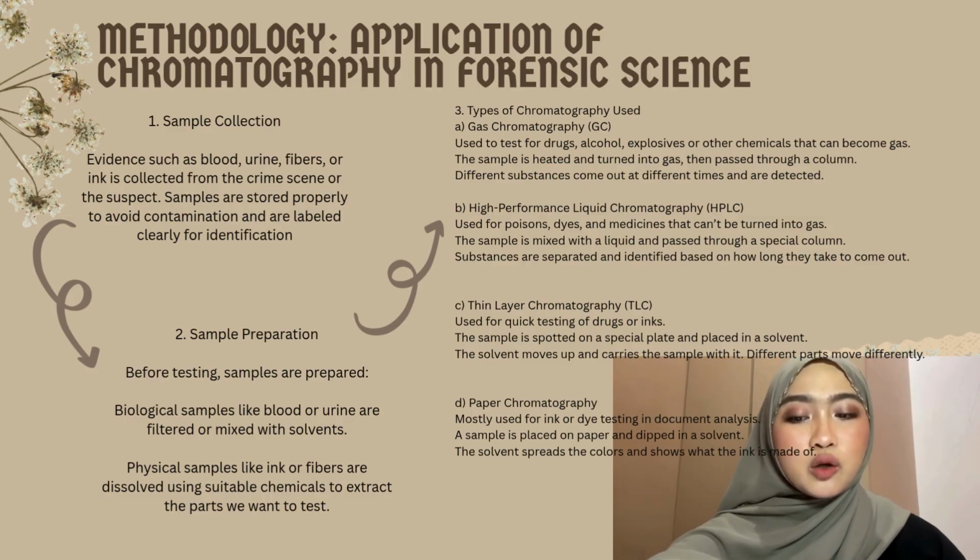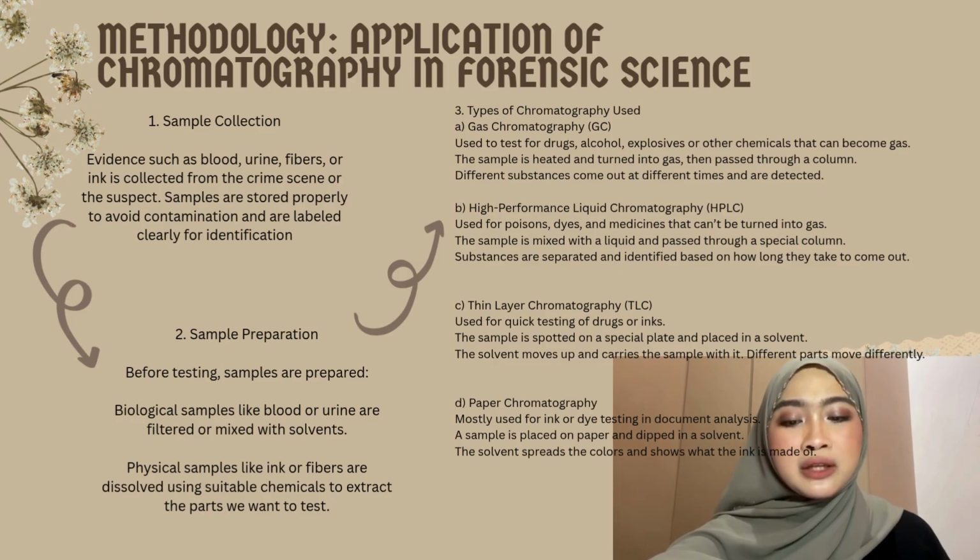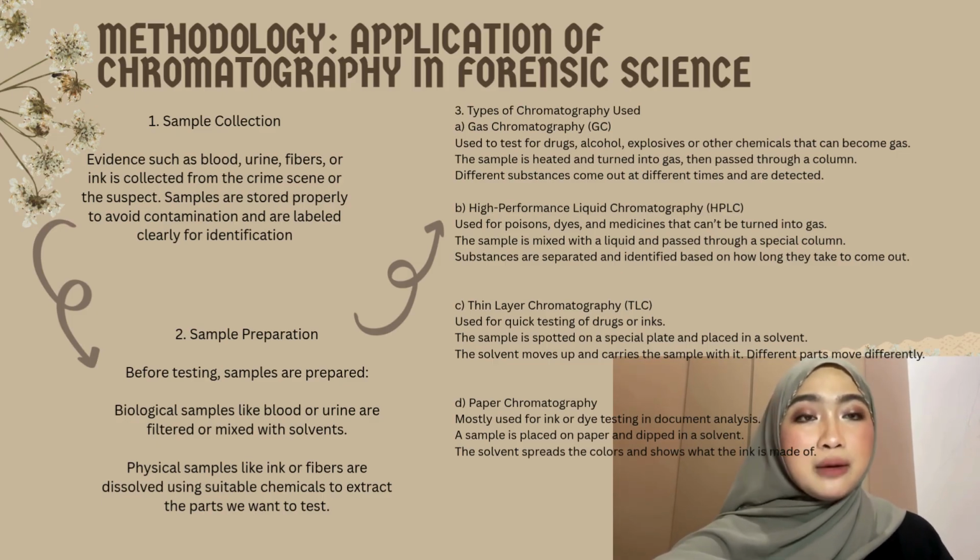For thin layer chromatography, TLC is a simple method for fast testing. We place a small spot of the sample on a special plate and let a solvent move it upward. Different parts of the sample move at different rates and show up as spots.